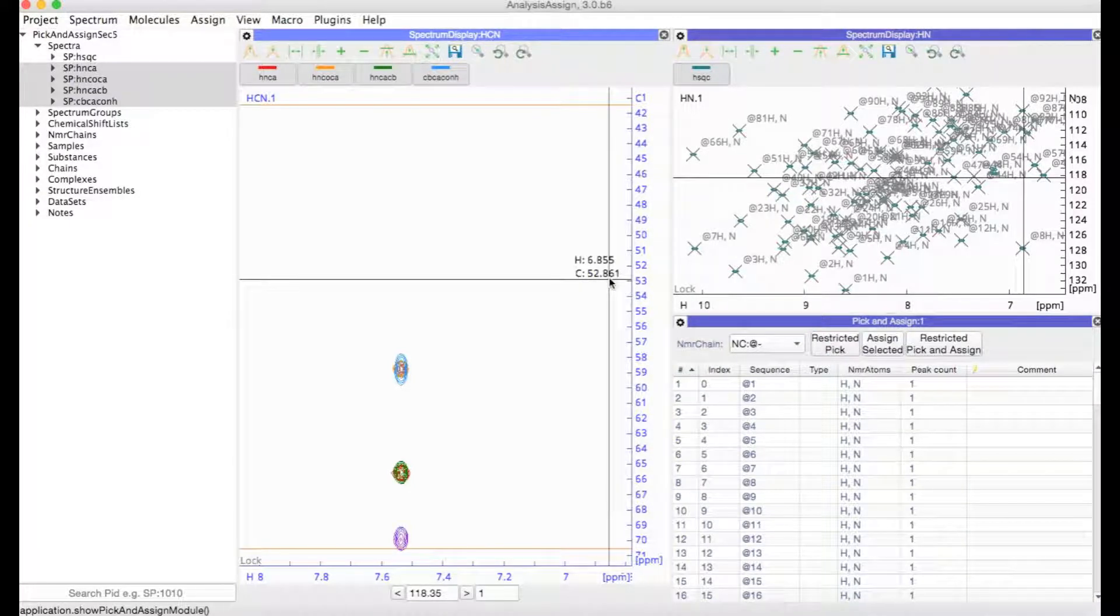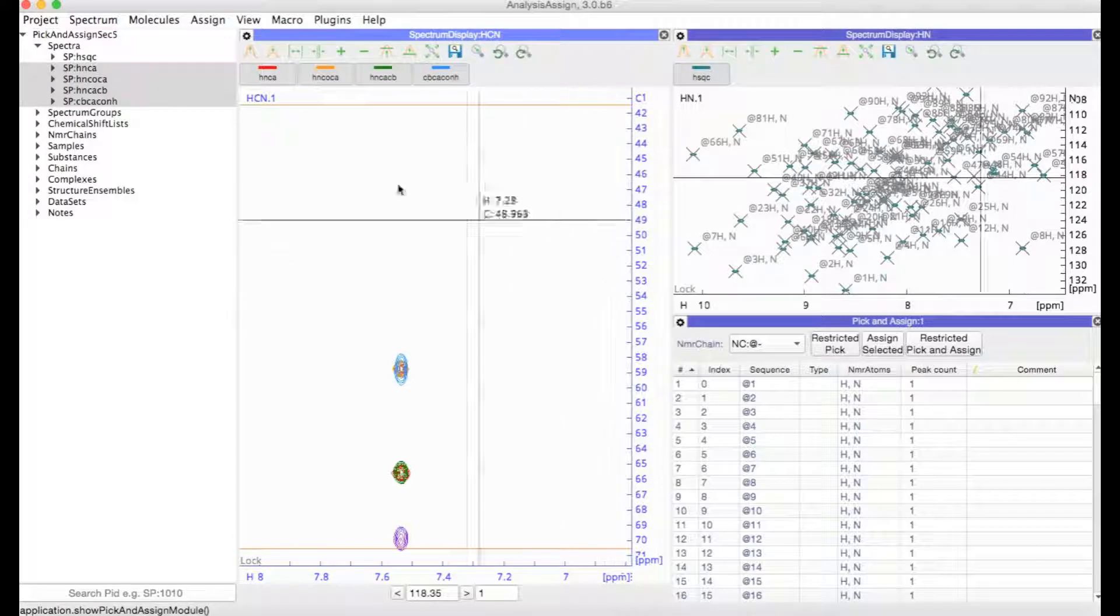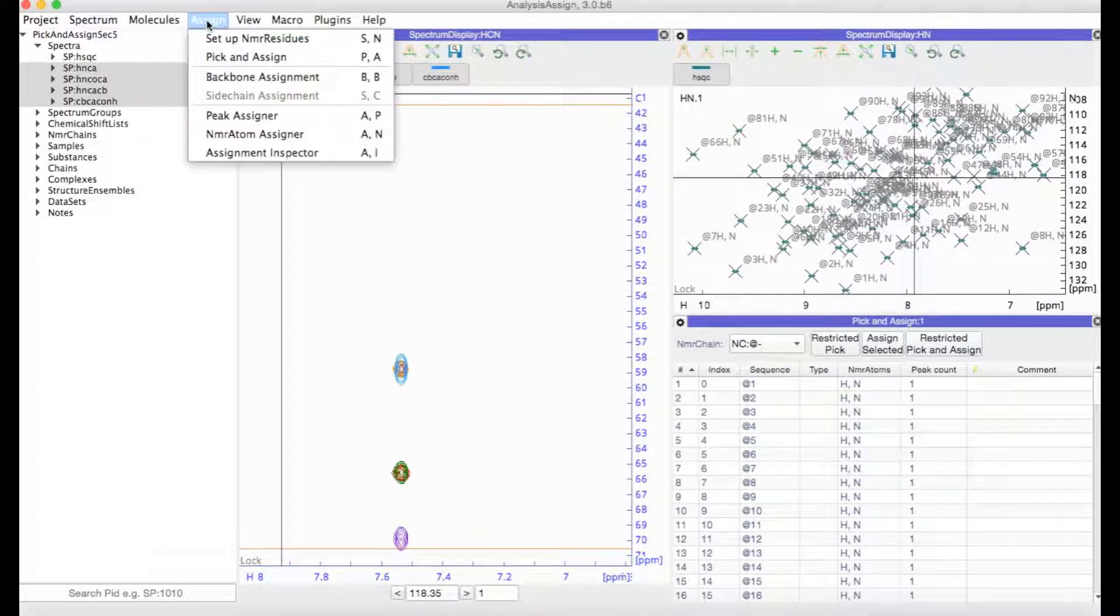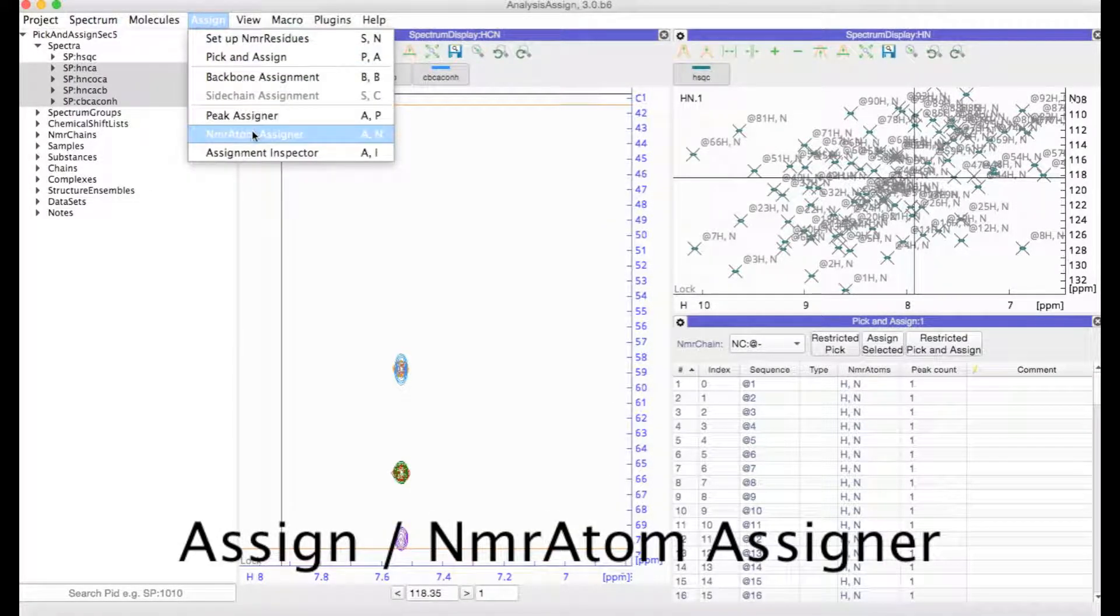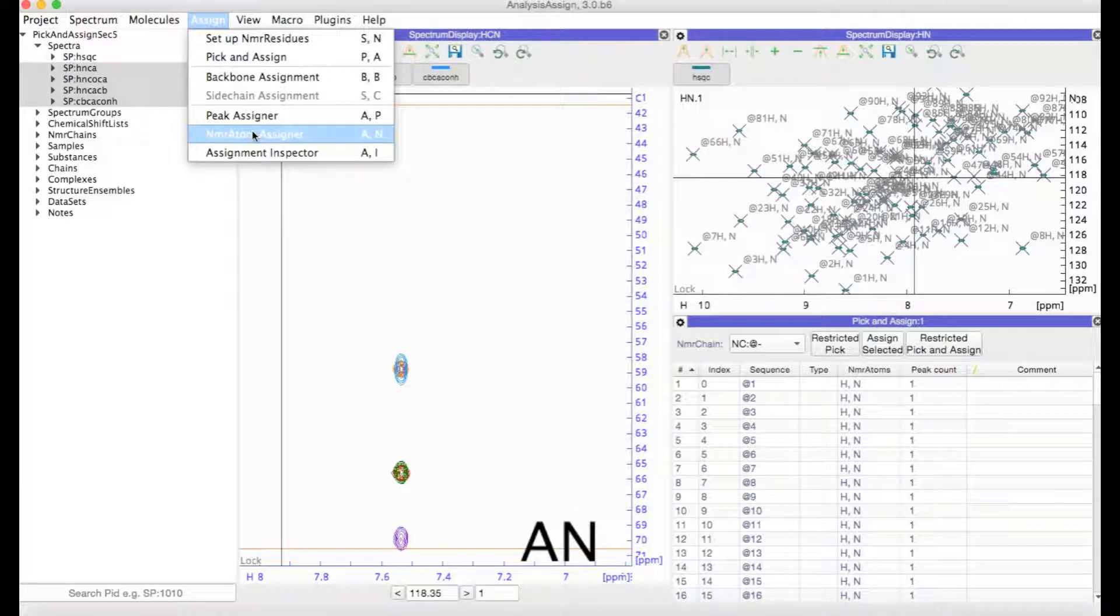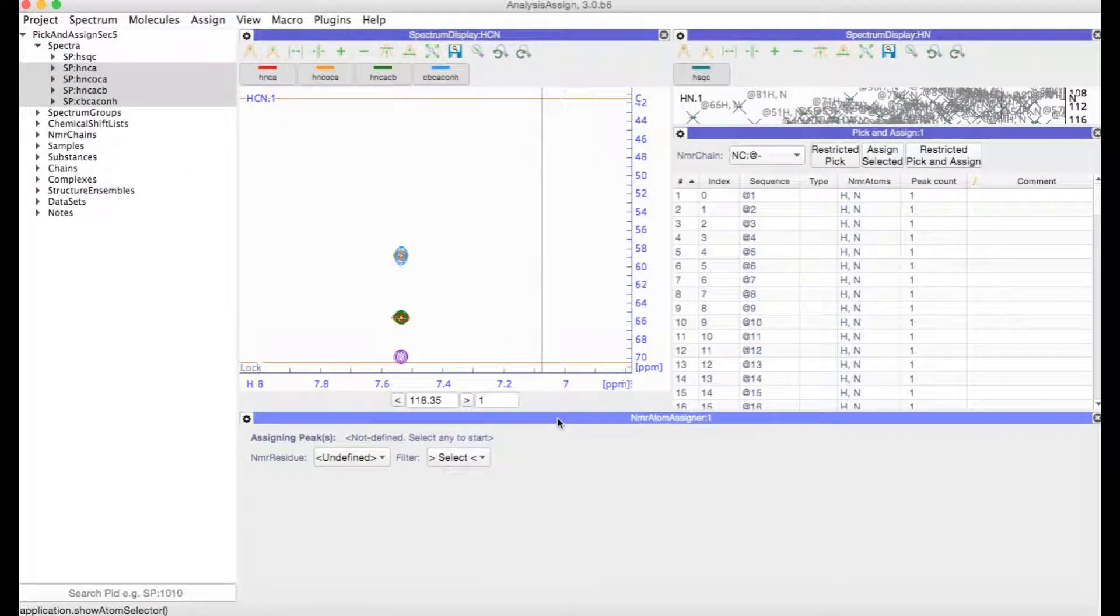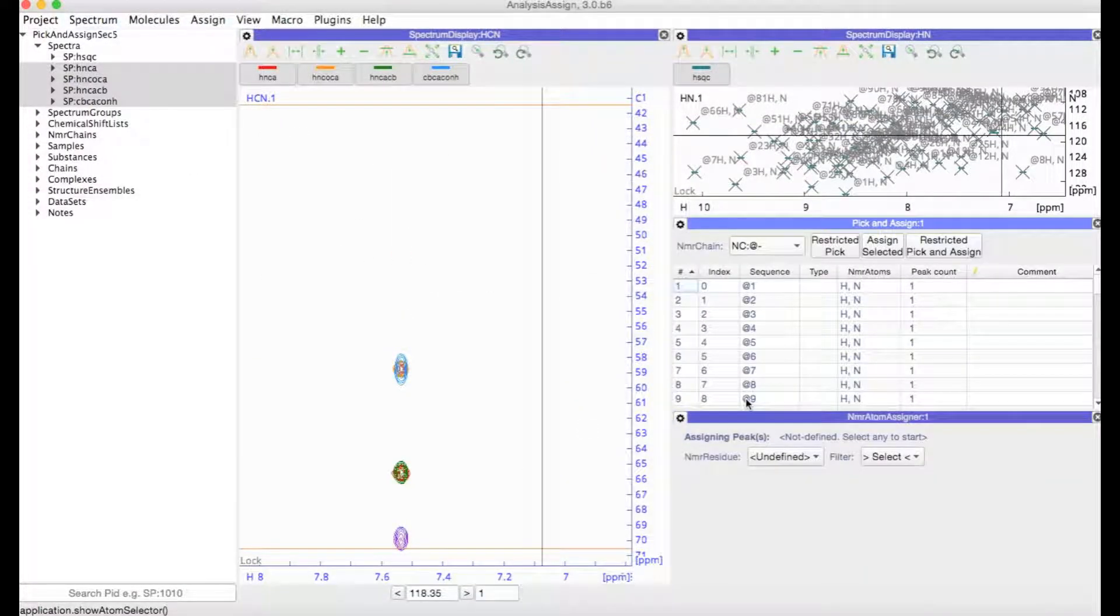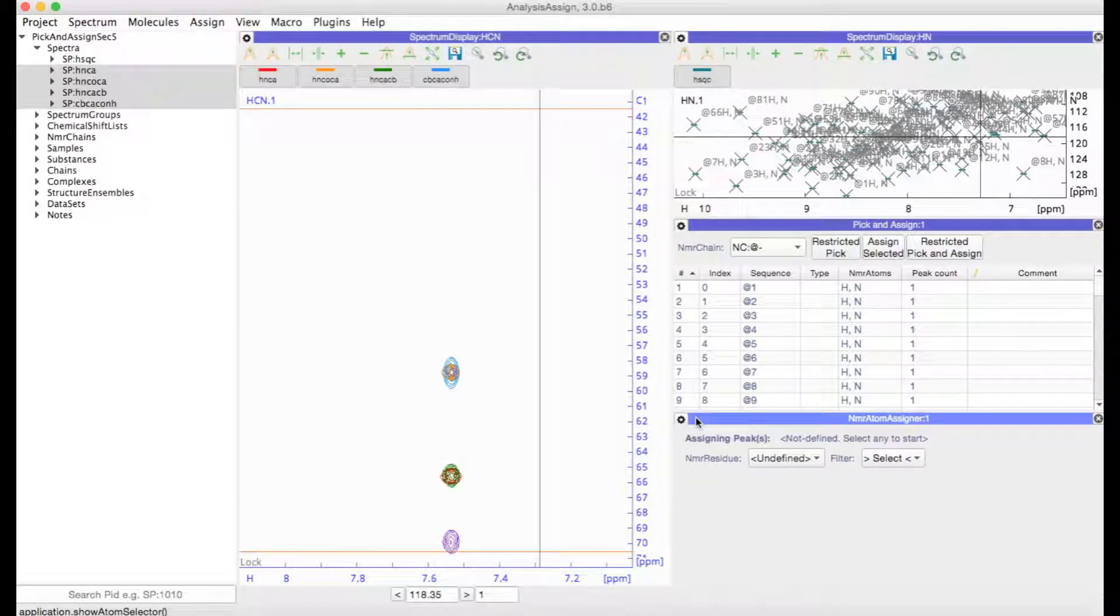It's also going to be useful to have the NMR Atom Assigner open. So you can go to Assign and then NMR Atom Assigner, or type AN for short. And then I'm going to place that over here.